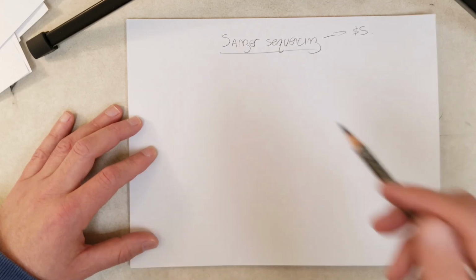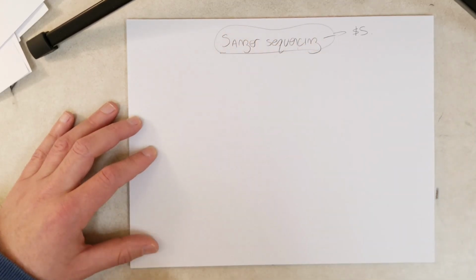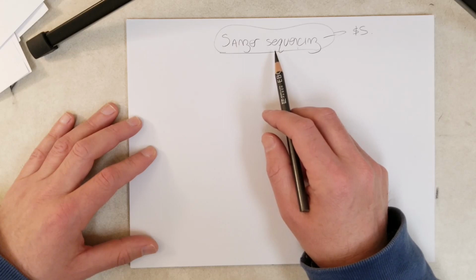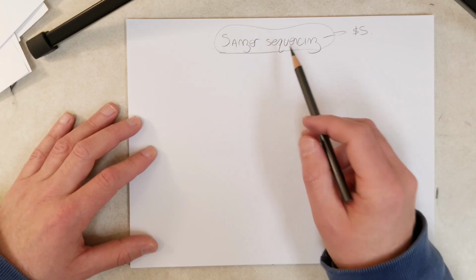Labs around the world rely on Sanger sequencing for most of their sequencing needs. Okay, so how does this process work? Well, it's a rather old process, a couple decades, and it has gone through some changes. So we're going to talk about the classical Sanger sequencing method and some relatively recent advances, and that would allow you to see how it is done today.